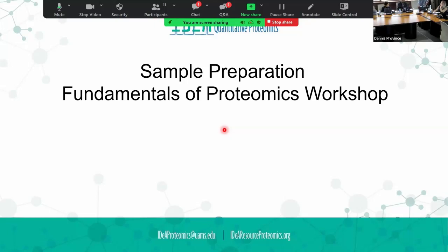There is a question. Does the depletion technique impact non-targeted proteomic study? Depletion for plasma or serum, I guess. The depletion technique will affect plasma proteins. Yeah, that eliminates albumin and some of those other proteins. Yeah, it affects it.